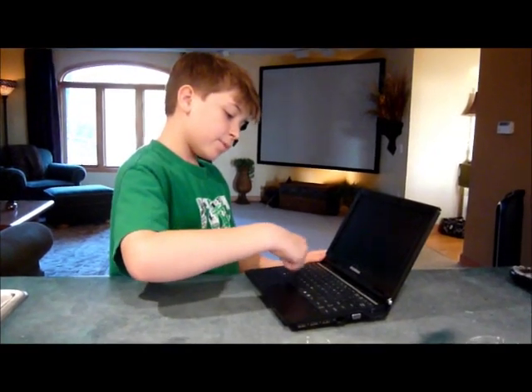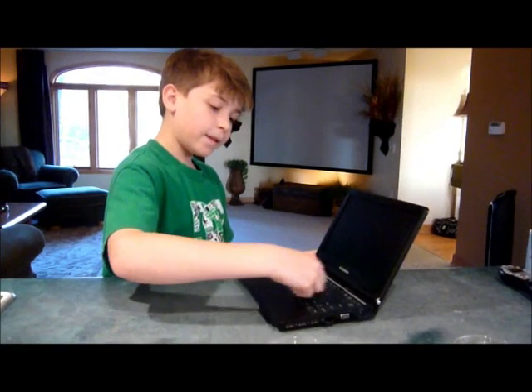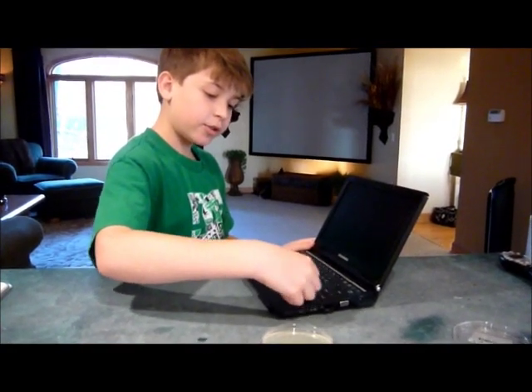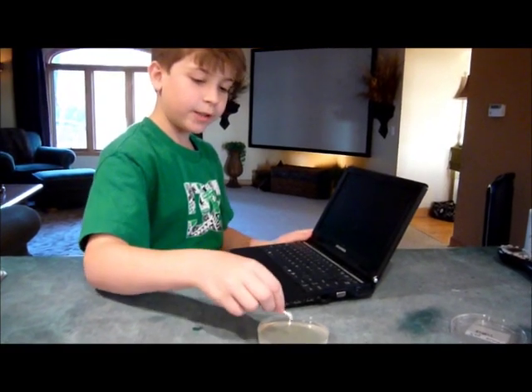Let's test the keyboard first. You dip this in water, then not too hard but not too light, rub it on the keyboard and then rub it on here.